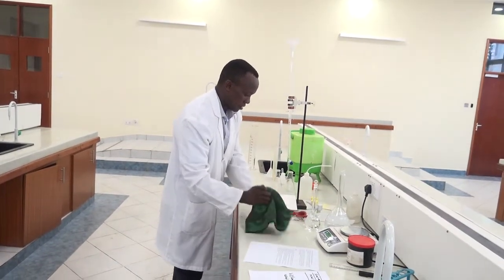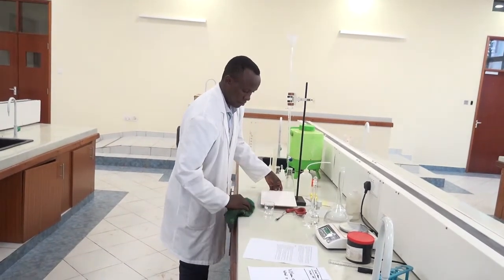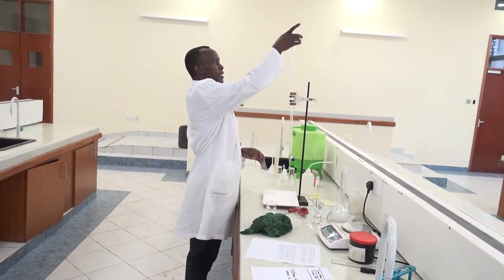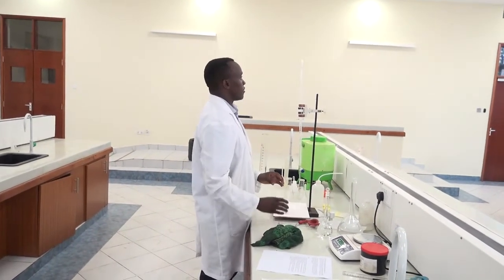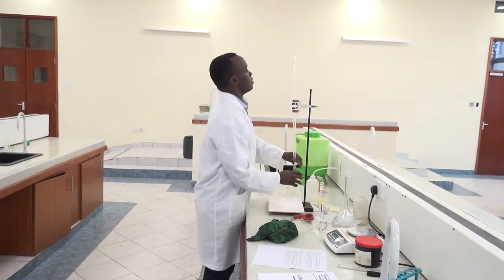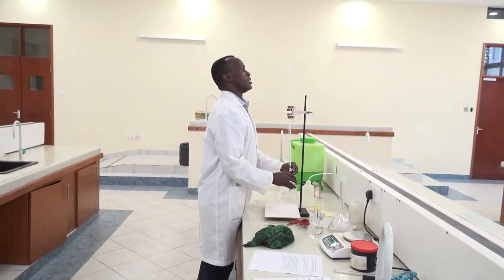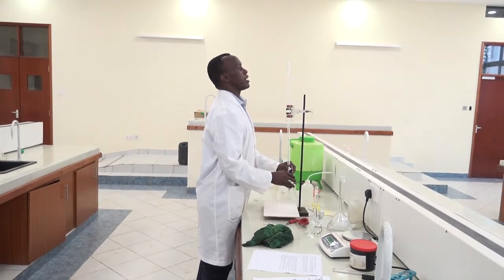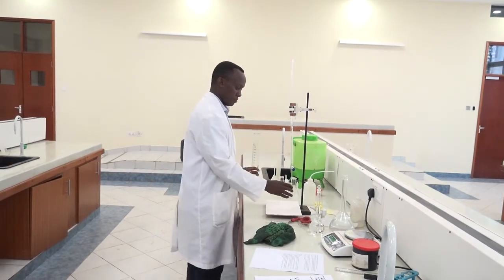After that, wipe the spill, then remove the funnel. After you have removed the funnel, you make sure that it is at the zero mark. There.